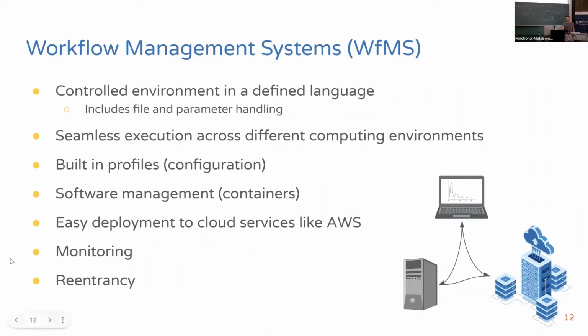Another big thing is monitoring. In a custom script, it would be hard to build a monitoring setup. And most of these workflow management systems already have that included. So you could easily follow which steps are performed at a given time, and they have error logs and all the stuff you need. Another thing is reentrancy. Most of these have options that if you change code in a later process, let's say, you don't need to run all the previous steps again. So you could just enter at a given point and continue.